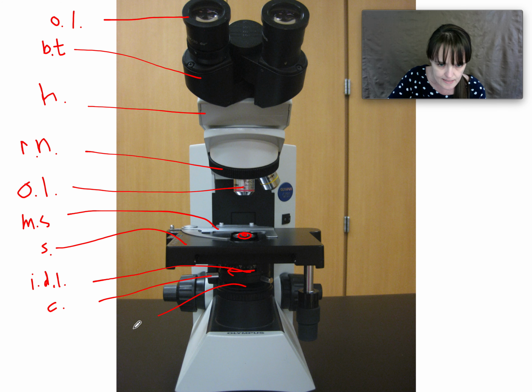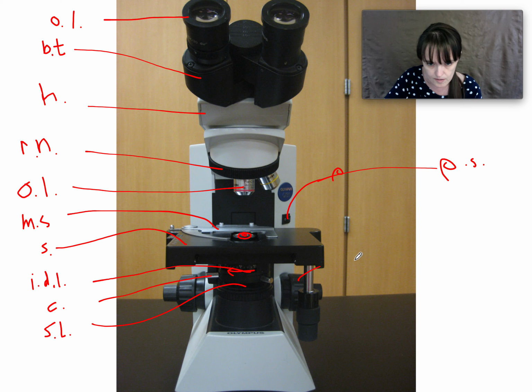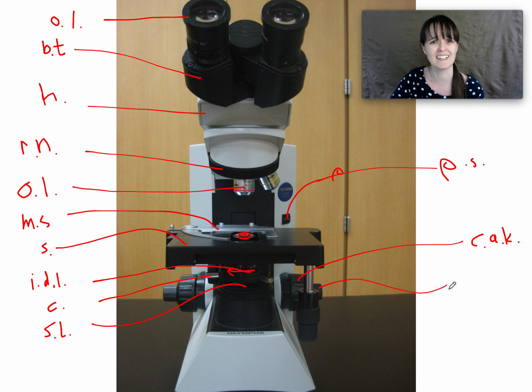And then this is the substage light, where the light comes through. Here is your power switch, the white one over on the side. And that one, coarse adjustment knob, the CAK. Okay. Without the silent E, it makes a big difference. And this is the fine adjustment knob, the FAK.